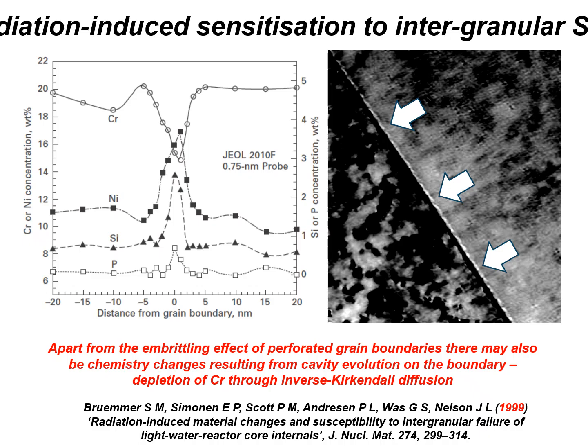So one of the things I've noticed is a lot of work, especially with stress corrosion cracking, that's been conducted in the last 30 years, focuses on chemical changes at the grain boundaries, with very ambiguous explanations for what was causing stress corrosion cracking.